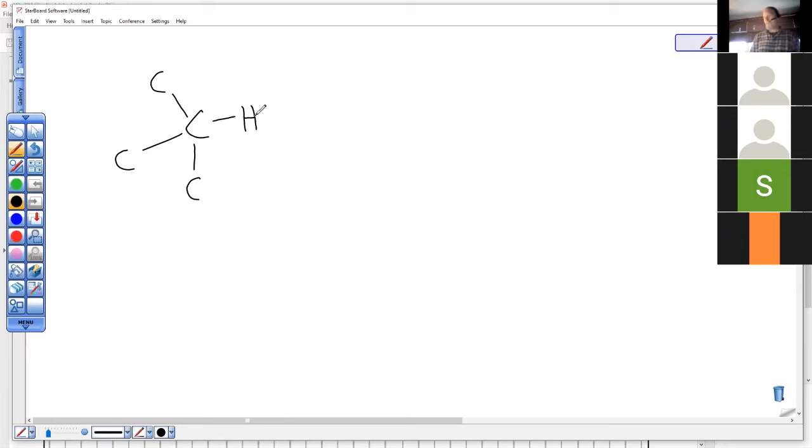Actually, one of them is double bonded to the other carbon. So now we're talking about a vinyl, right? This is an internal vinyl carbon. And how many neighbors did you say there are? That carbon is a singlet, and the one in the middle is attached to a 3rd carbon. Instead of the hydrogen, it's another carbon. So there's no hydrogen there at all? No hydrogens on that carbon.